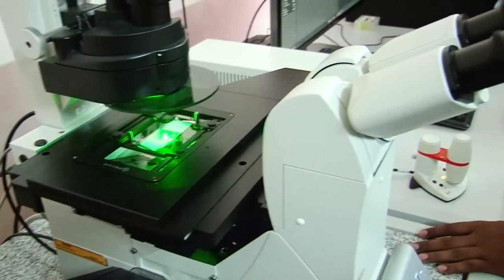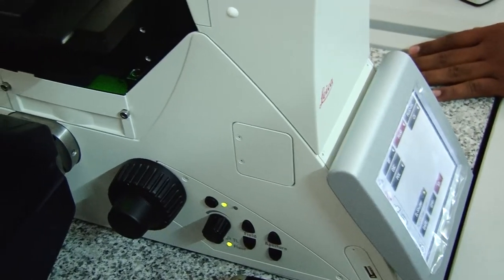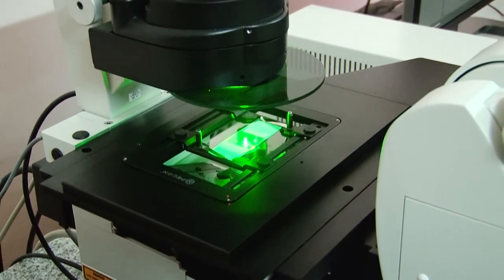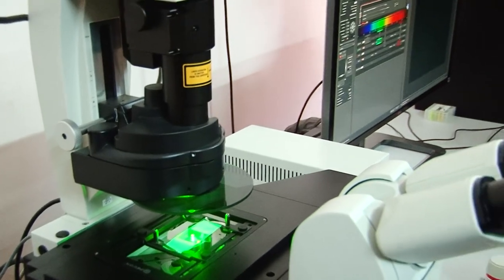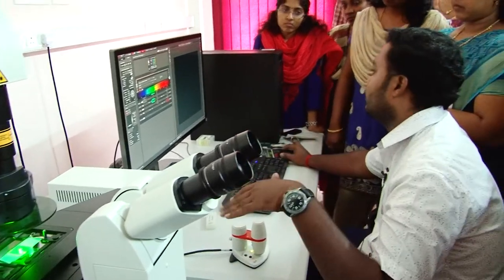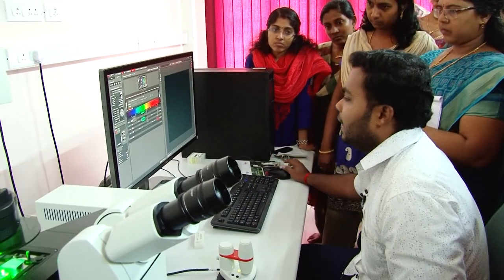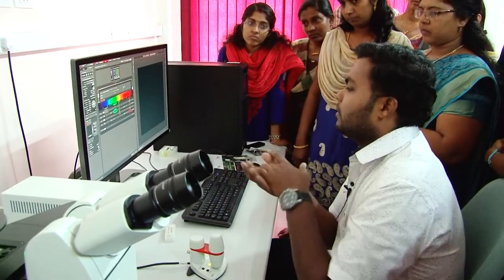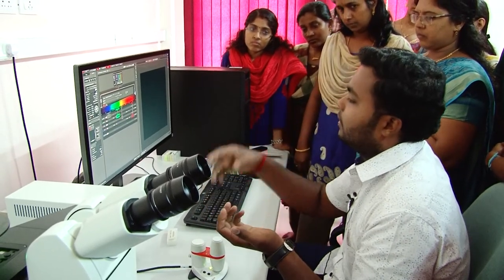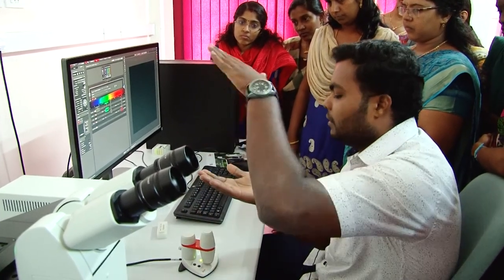Last day you guys learned how to take fluorescence and autofluorescence, all that. Today we can use the Z-stack also, so we can get a 3D image of that thing. It is somewhat difficult because it should be getting focused. We should know where it is getting out of focus and where it is getting focused on the top side. Because we section it using these confocal planes, we just incident the laser and select the Z value. Z value means the Z position.